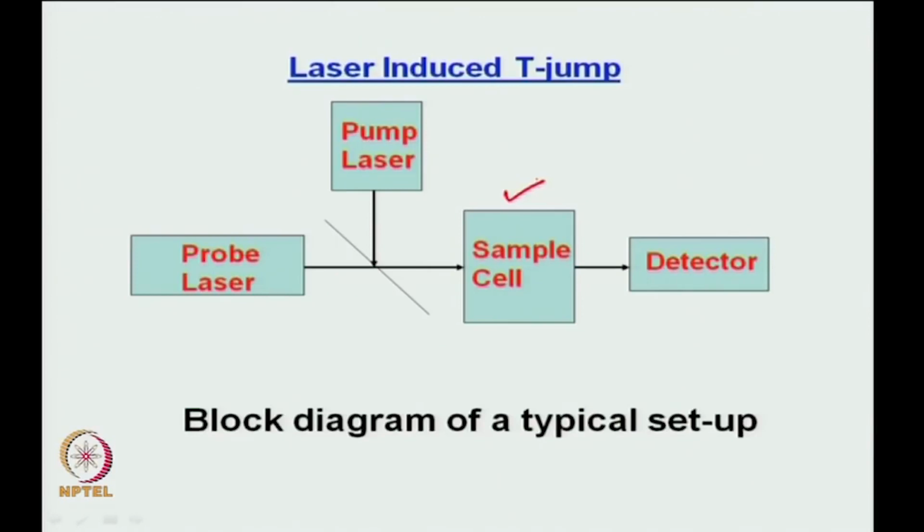Now, you are trying to increase the temperature from T1 to T2, making sure that T1 to T2 are in the transition region, at least the spectroscopic change between T1 to T2 is decent enough for you to get something out. Now, what does this pump laser do? So, look at this pump laser. What does this pump laser do? I will show a better diagram in the next slide, but let me tell you this.